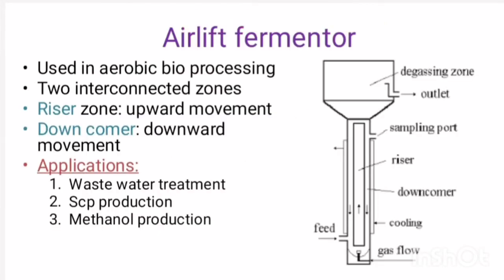Airlift bioreactor. This type of bioreactor is mainly used for aerobic bioprocessing technology, and also it is used in wastewater treatment, SCP production, methanol production, etc.